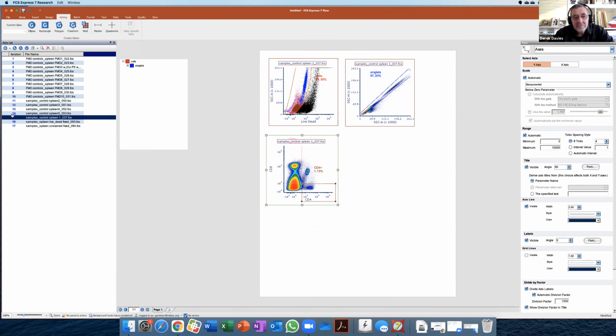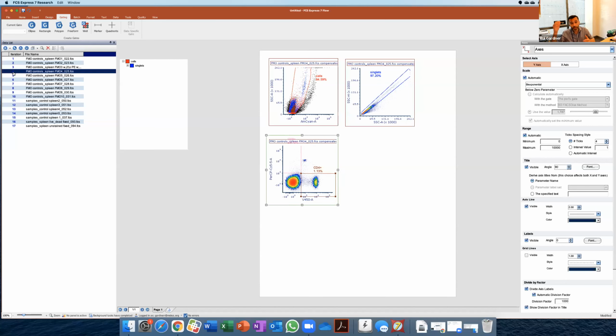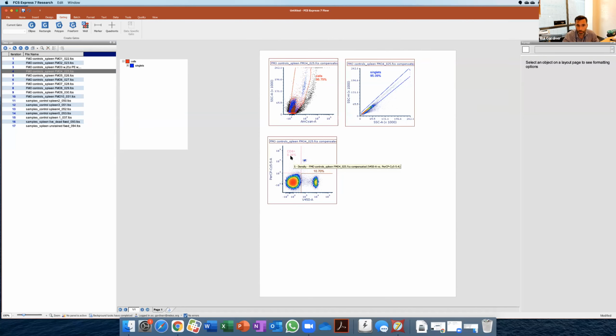Exactly. Yeah, so correct, and you saw that I was hesitating a little bit. One of the criteria that we typically use is, depending on whether you have a relatively frequent population, that anything below 1% will be negligible, right?